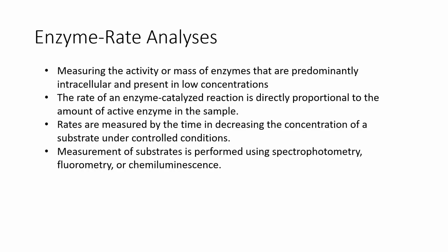So basically, to determine if an enzyme is active and determine the rate of that enzyme, we determine the disappearance of the substrate or the formation of products. And the disappearance of substrate or formation of products can be evaluated using other techniques that were discussed previously.